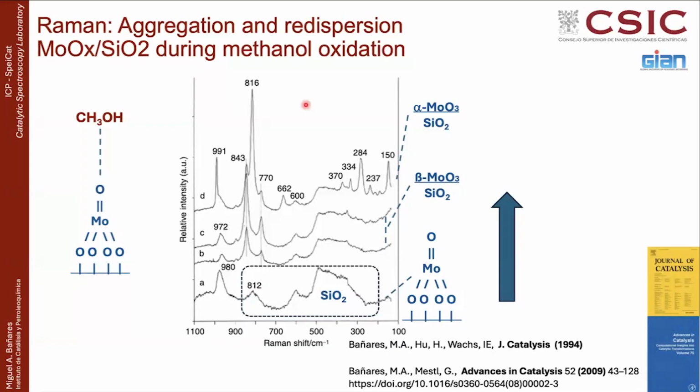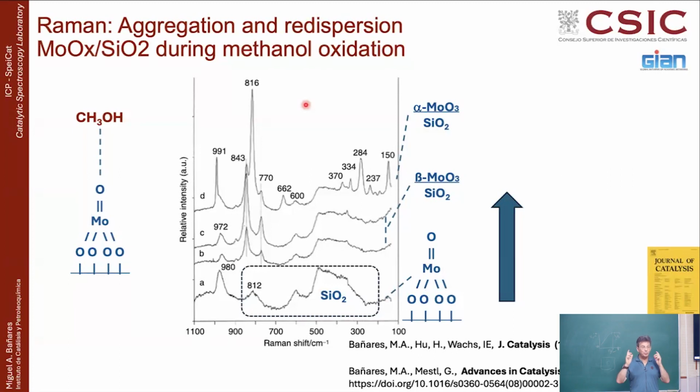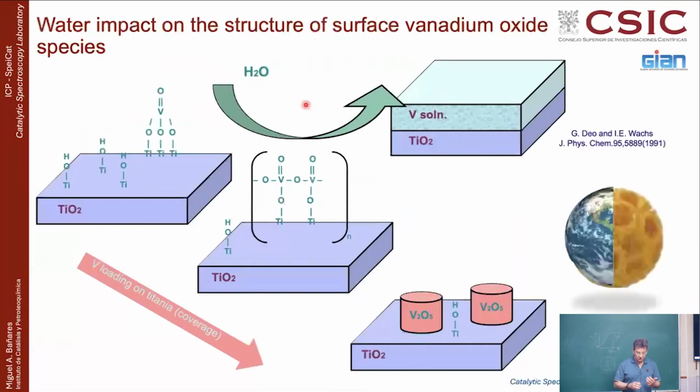Okay, so these are changes that we're observing, and we're still not doing operando, but we're already in conditions which are relevant to catalysis. We are making reaction in situ studies, where we are mimicking the reaction conditions. We're feeding methanol and air, and we already see changes. Now, the most important question that arises is water, because water is everywhere.